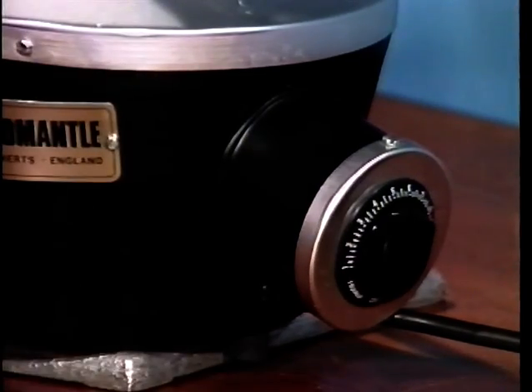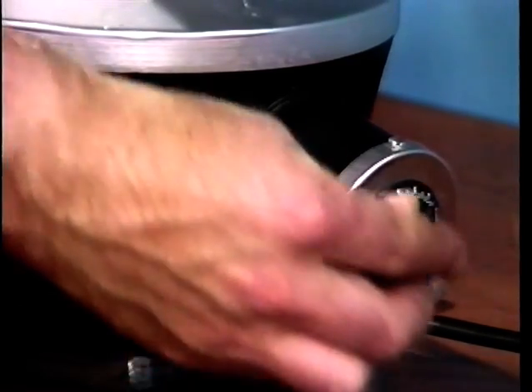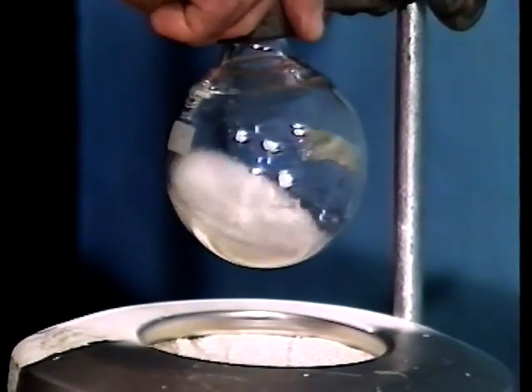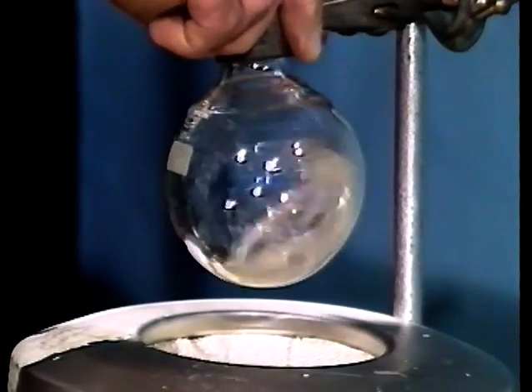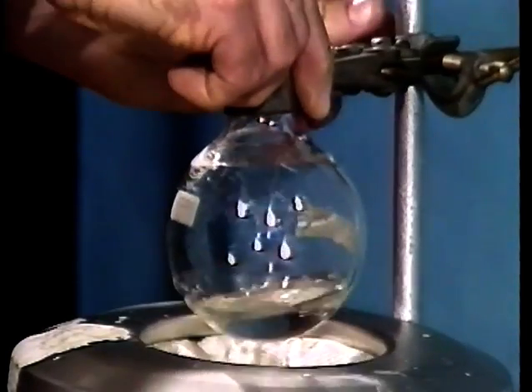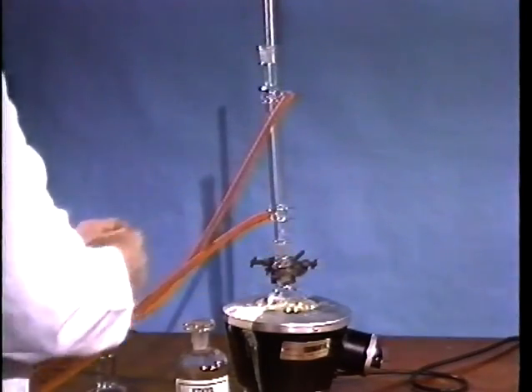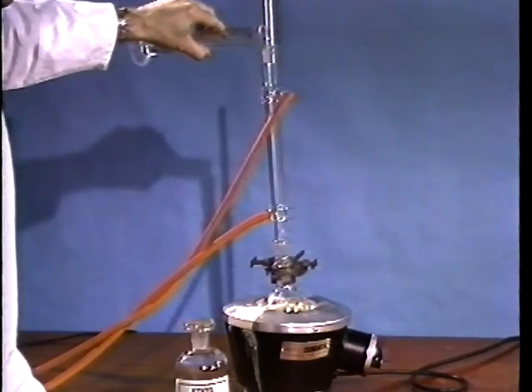Turn on the heating mantle and bring the solvent to the boil. If the solid doesn't dissolve completely after a minute or two under reflux, then you must add a little more solvent through the condenser.